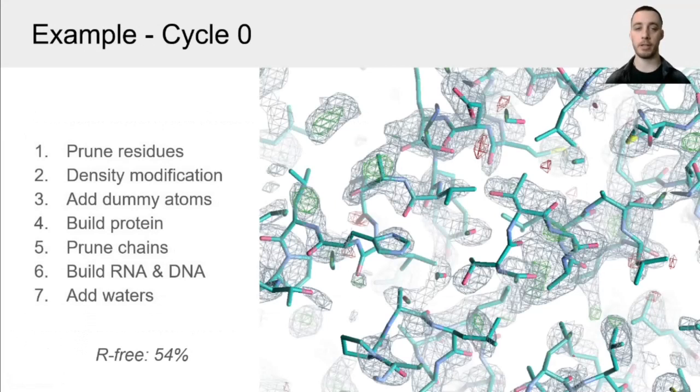So I'll take you through an example of this where it was a difficult molecular replacement problem. It was a poor starting model where ModelCraft managed to improve it quite a lot. So the target data is 2.25 angstrom resolution, and it's aiming for a protein with 4 copies of a 435 residue protein. Now, I took a model from AlphaFold, got rid of residues with high uncertainty, and then used that as a model in Molrep.